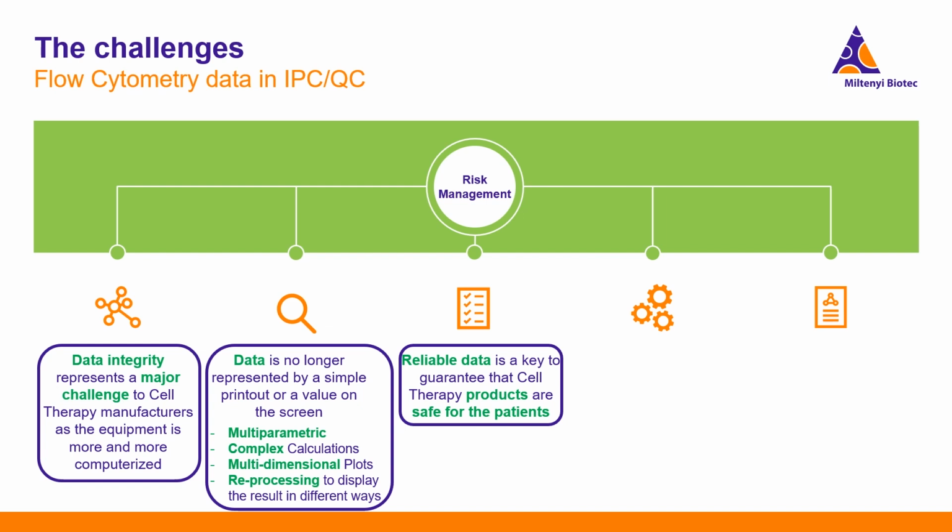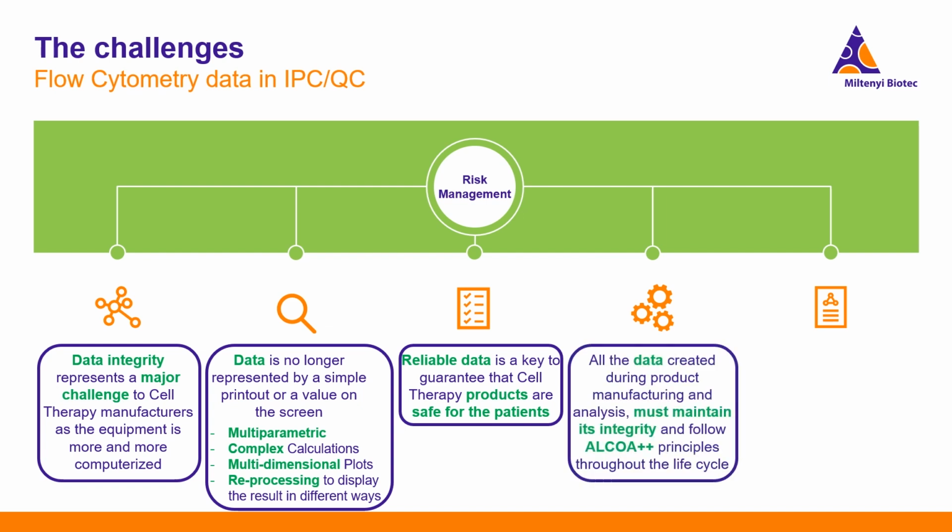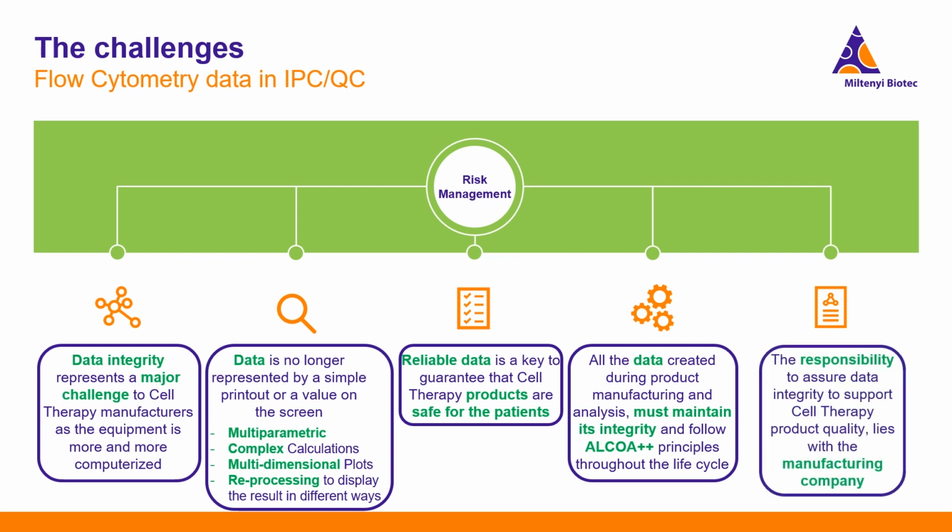Reliable data is at the same time key to guarantee that cell therapy products are safe for the patients. All the data created during product manufacturing and analysis therefore must maintain its integrity and follow the so-called ALCOA principles throughout the whole life cycle. The responsibility to assure data integrity to support cell therapy product quality lies with the manufacturing company.